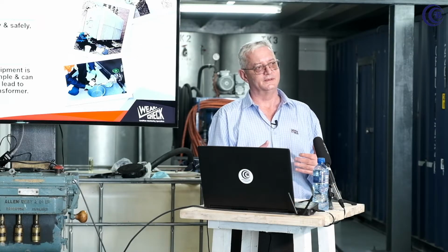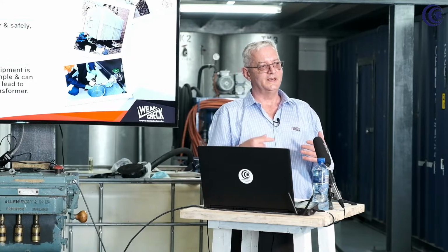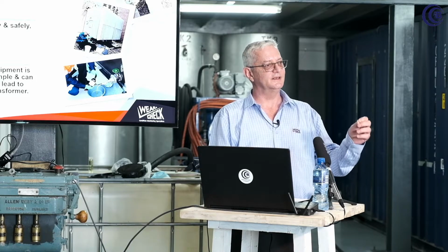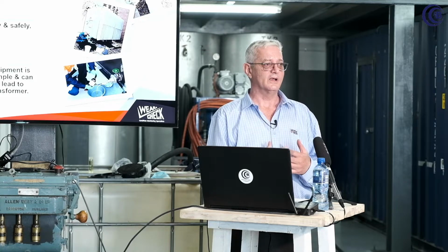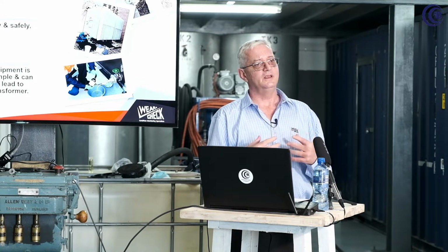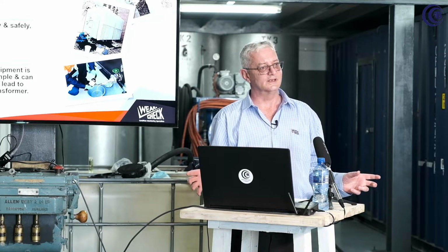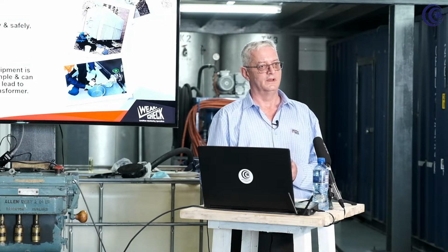results are accurate. But the results are only accurate according to the sample we have received. The laboratory can't even tell that the sample is definitely from substation A, transformer 2. The label is saying that, but I can't give that promise. We can only promise that the results we gave out are accurate according to the sample. And everything starts with sampling.